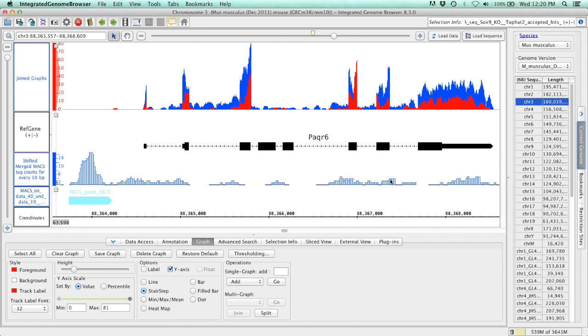So it's really a great visual analysis tool, just the ability to combine all of these different types of files and analyses and carry out your own visual analysis. An image like this would be great for publication, and actually, the publication that I pulled this data set from has an image almost just like this. We can go ahead and make this look how we want.